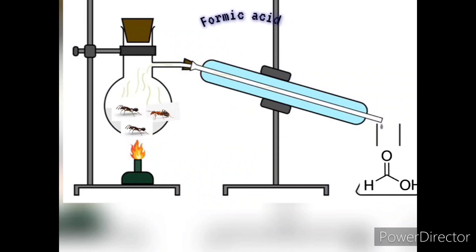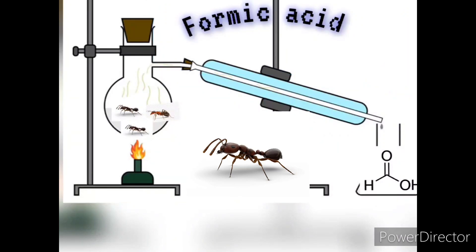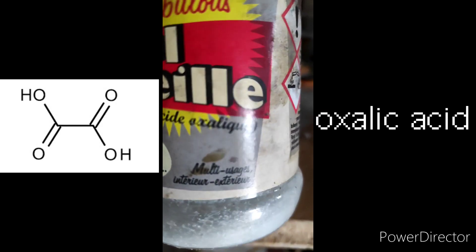But the point of this video is not to sacrifice hundreds of ants or deal with carbon monoxide. We will do the easiest way which is to distill a mix of oxalic acid and glycerol. Both are very easy to obtain in a shop or you can even make the glycerol yourself with cooking oil.